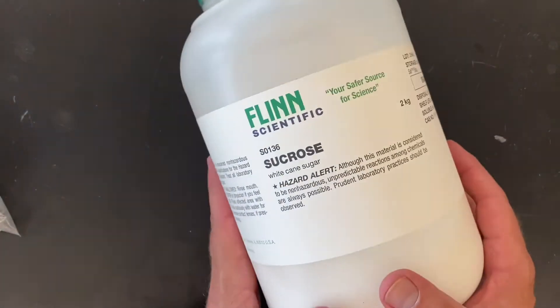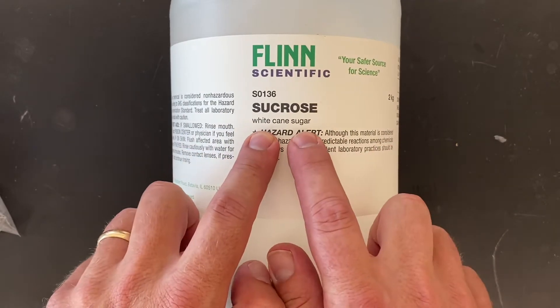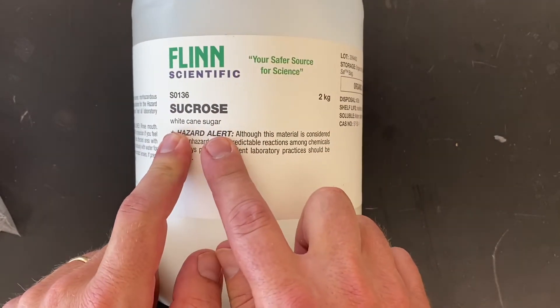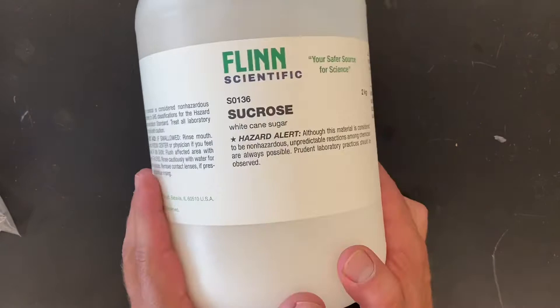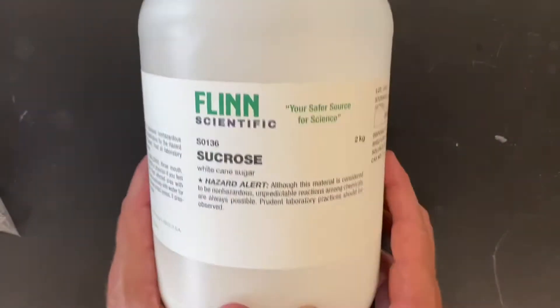Starting with the largest bottle first, we have this one with a fancy name — sucrose. But if you read underneath it, it's basically white cane sugar, the same stuff you'd buy in the grocery store with a fancier label. We'll use this for a couple of fun demos throughout the year.